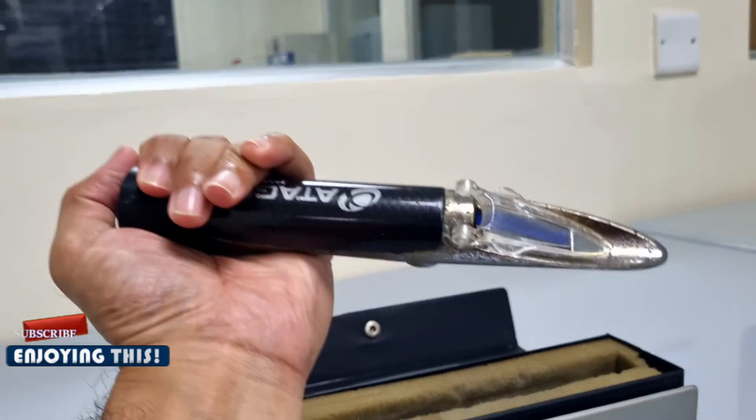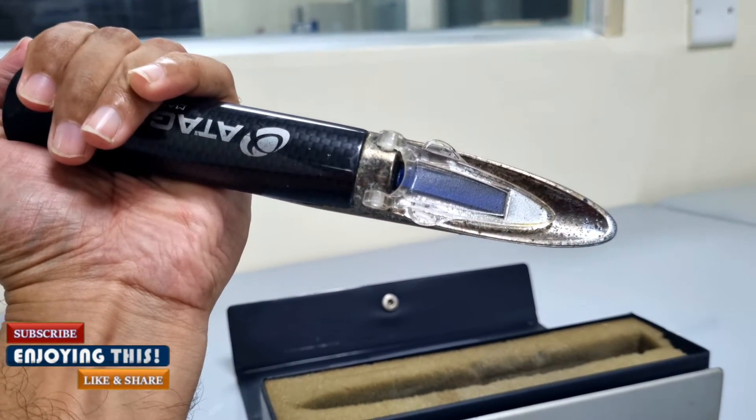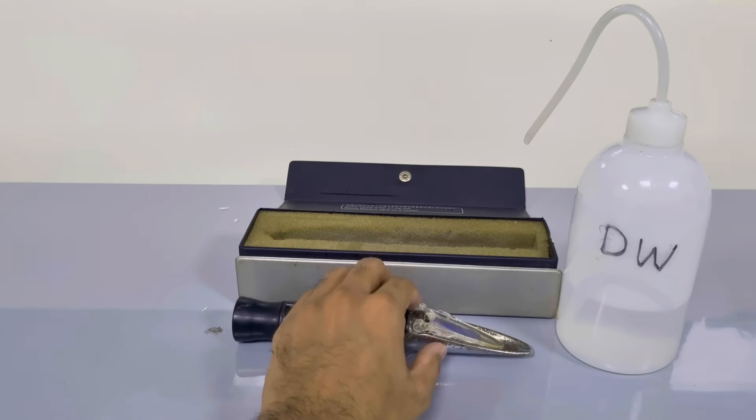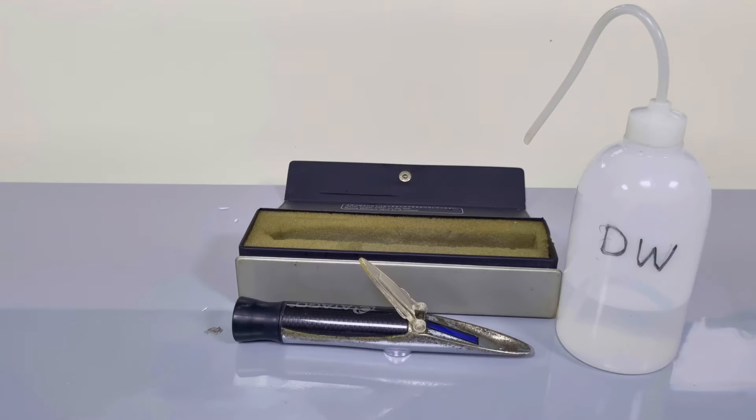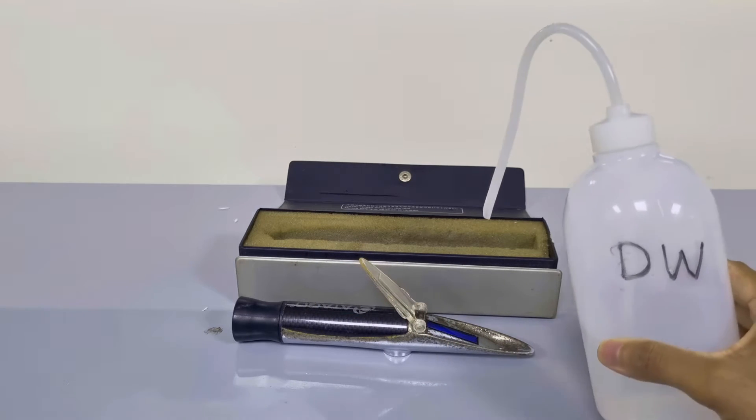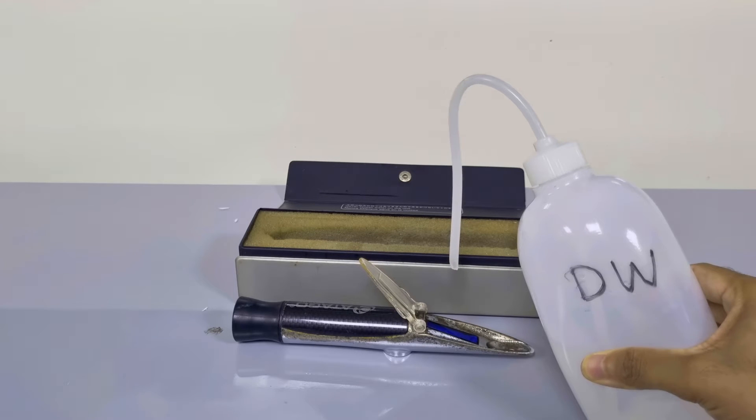Calibration is done first to determine whether a reading of 0 is obtained or if a correction needs to be applied. Add few drops of distilled water to the prism of the refractometer.